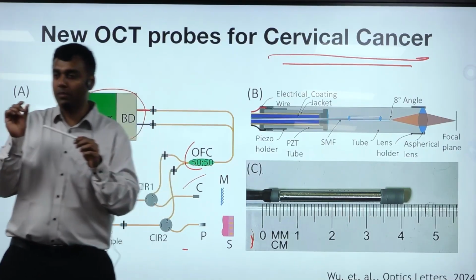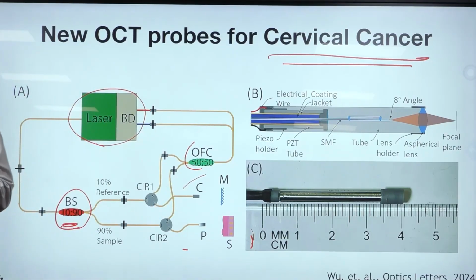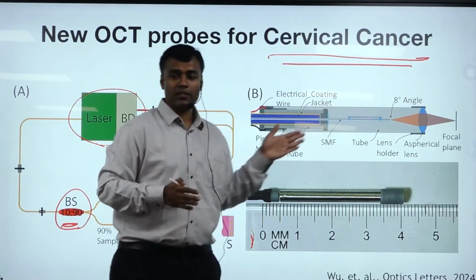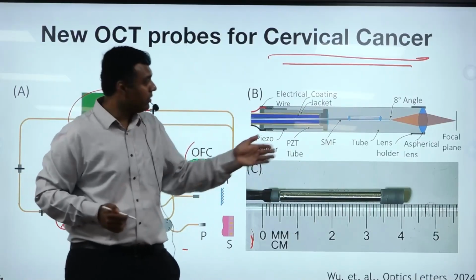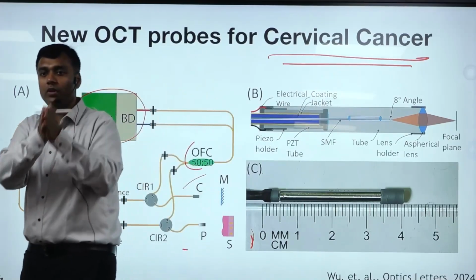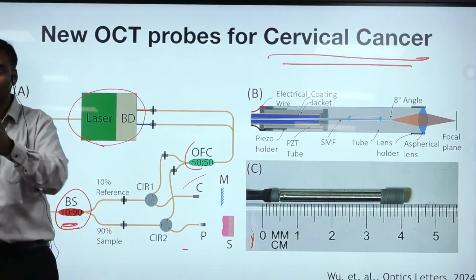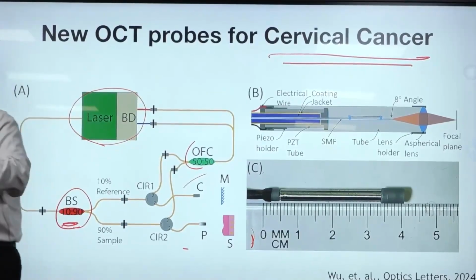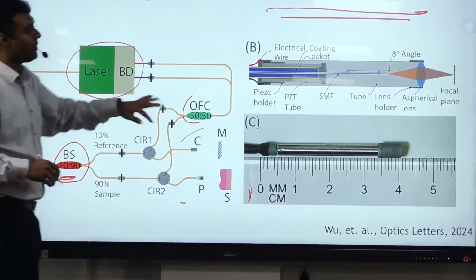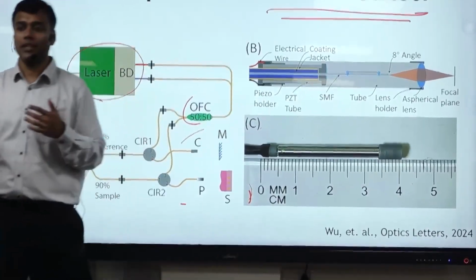You take an optical fiber, cut it into a small piece, less than a centimeter or so, and glue it along the y-axis. Now the stiffness along the y-axis is different from the stiffness along the x-axis, and therefore the resonant frequency along the y-axis becomes different from the resonant frequency along the x-axis.